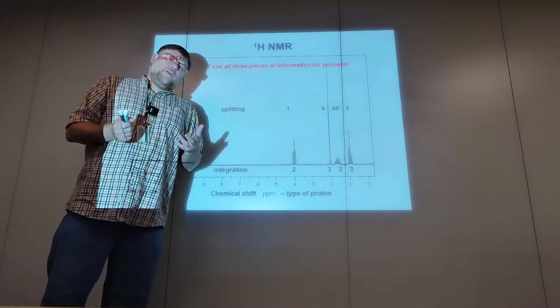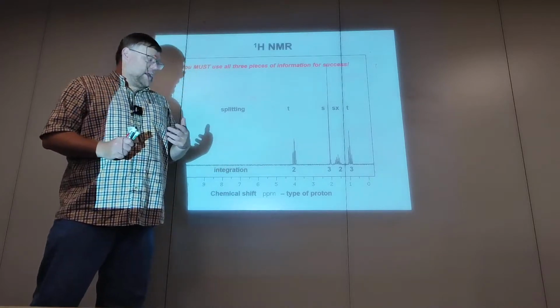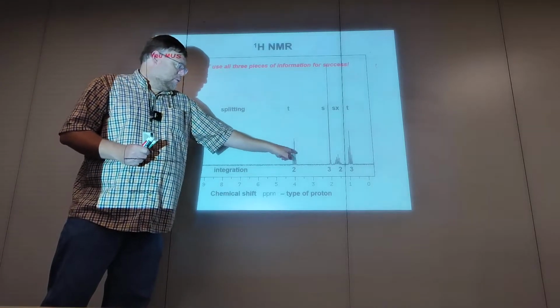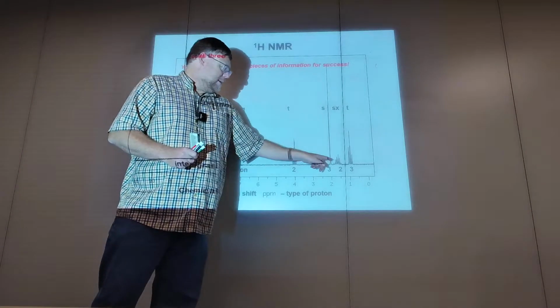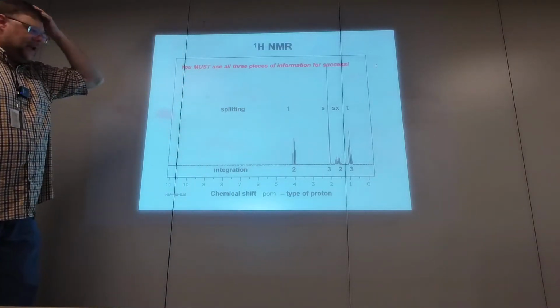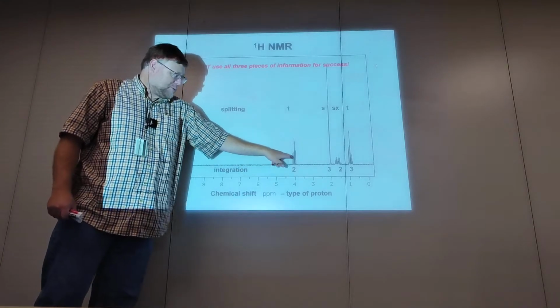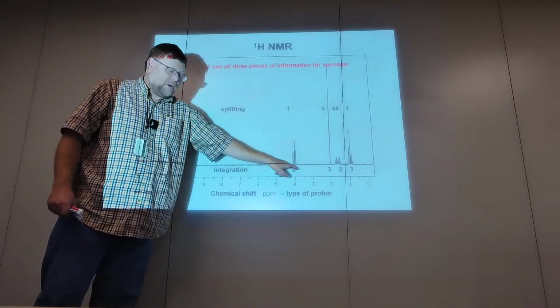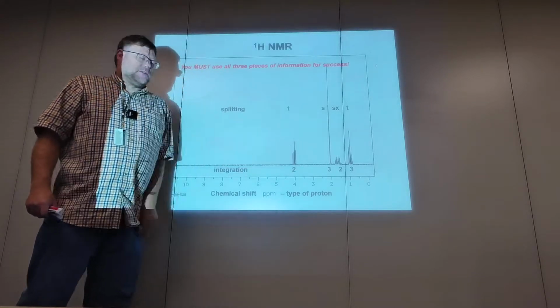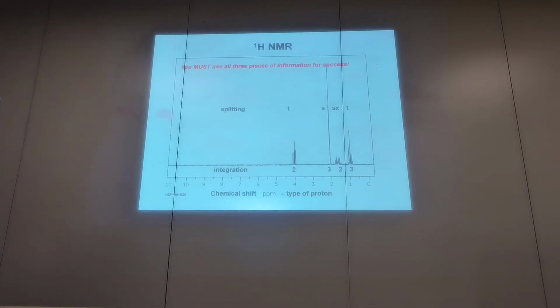And often I'm asked, how do you know this is a triplet and not three singlets? Well, it could be three singlets, right? That would be bad luck. Triplets are going to be 1 to 2 to 1. Singlets are just going to be a line. Quartets will be 1 to 3 to 3 to 1. You sort of learn to read that. But yeah, it's a worry, but if I give an integration, like if this was three singlets, I would say 1 1 1 or 1 2 1 or something like that. If I just say 2, I mean this is a triplet. Use all that information.